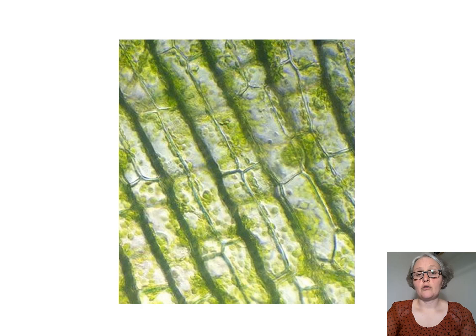The third organism that we looked at was another eukaryote. This specifically was a plant cell called Elodea. Each one of these rectangles that you see is a unique cell. That outer side of the rectangle is where we have the cell wall and the cell membrane, and those little green dots are the chloroplasts where photosynthesis takes place.